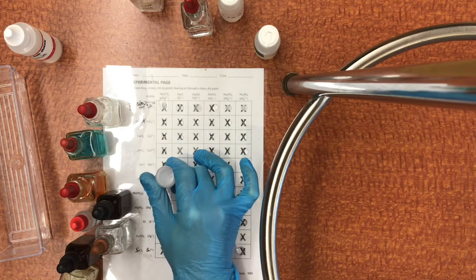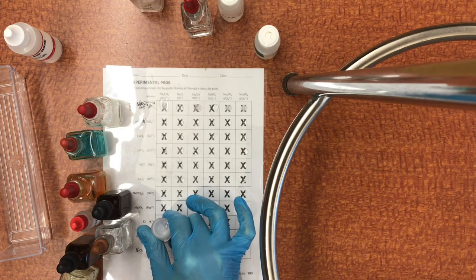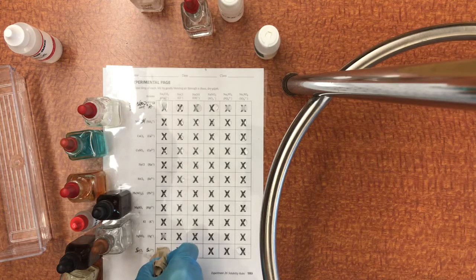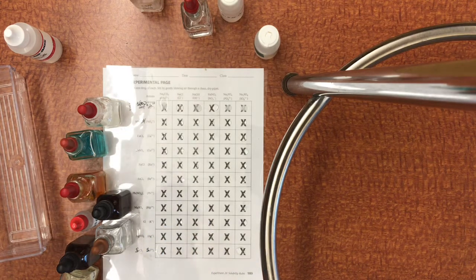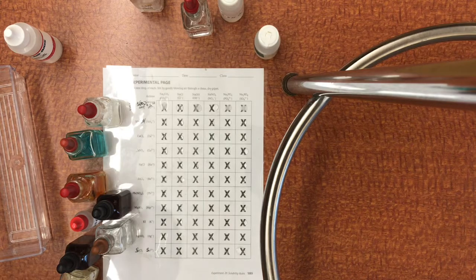The biggest trick when you have one of these sheets is not to drop your arm in it. Oops. Oh, that's not good. This stuff is pretty concentrated. Just one second. See if I can clean that up. Two more drops here. Of course, no. No. That'll be a mess.